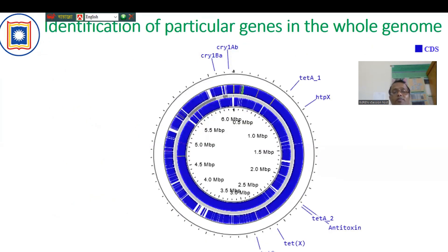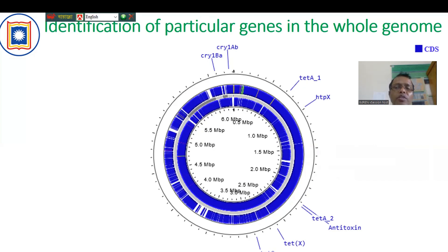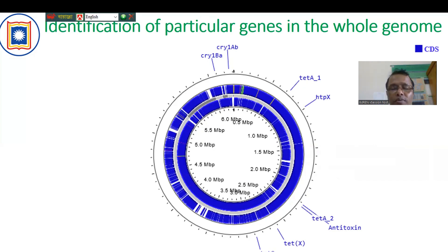You can pick what type of gene you are interested in. For example, if you want to show some cry genes — Bt genes B1, B2, and also Cry A, B, C — if those genes are present in your sample, you can show them. You can also show tetracycline resistance genes such as tetracycline A, tetracycline A2, and other important proteins in your figure.